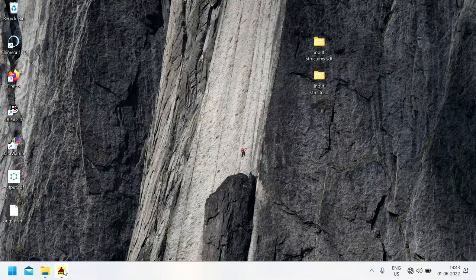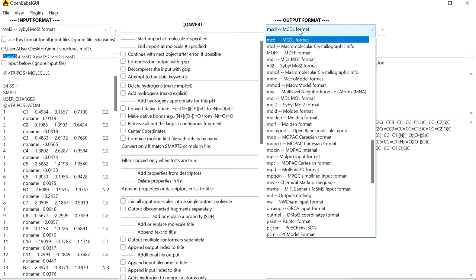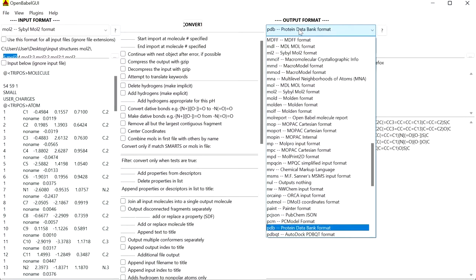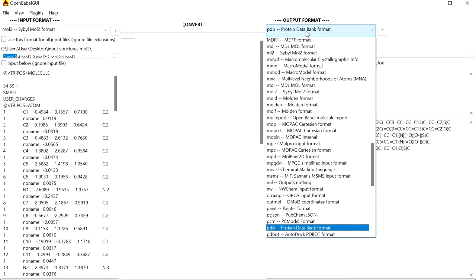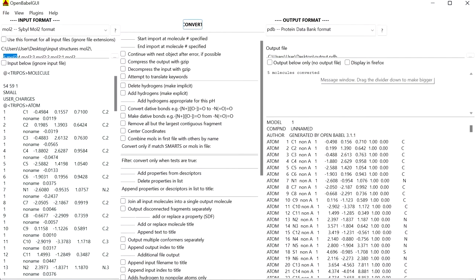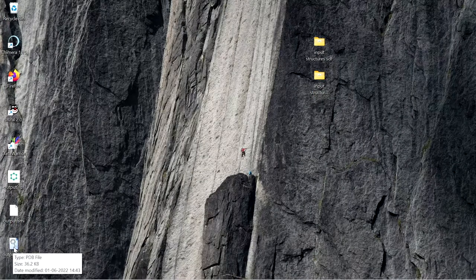You can do this for other formats also. For example, now I am going to choose pdb and change the output file name to output.pdb, and click on Convert. Now you can see these five molecules are converted, and in the desktop you will find output.pdb. This pdb file will contain five molecules.